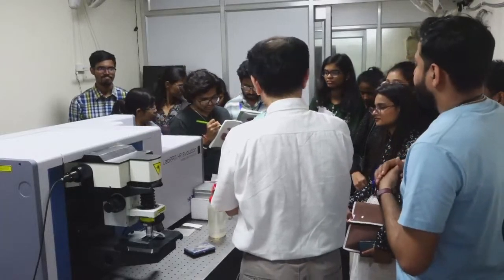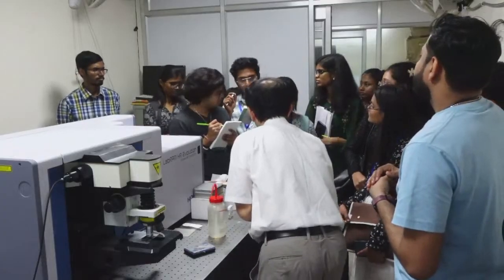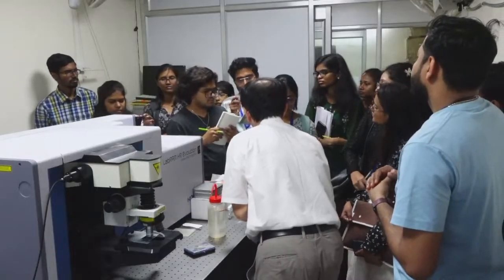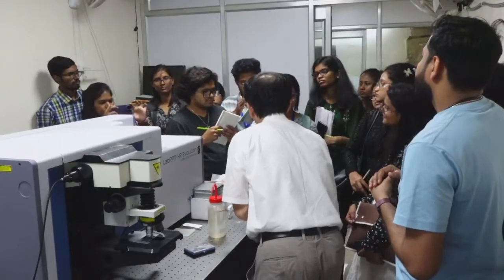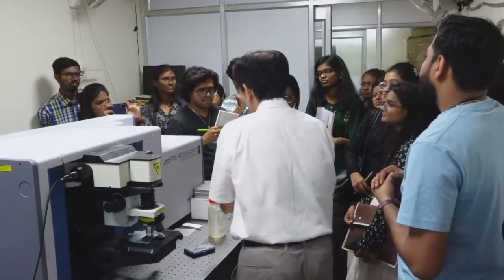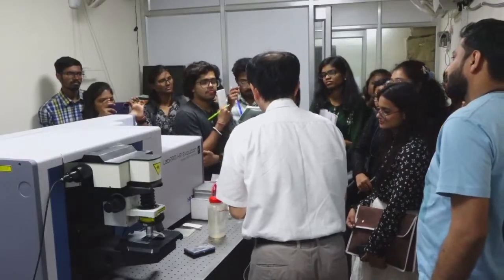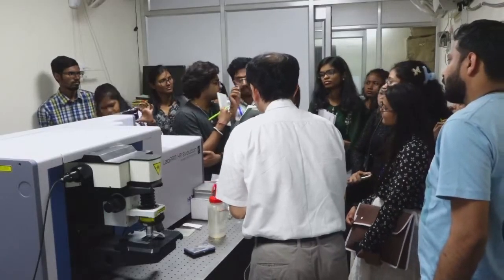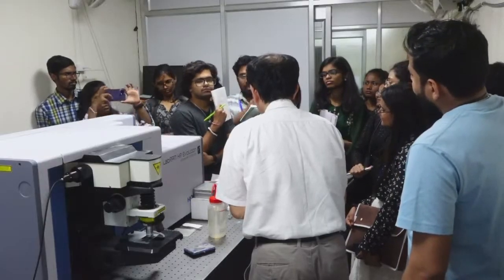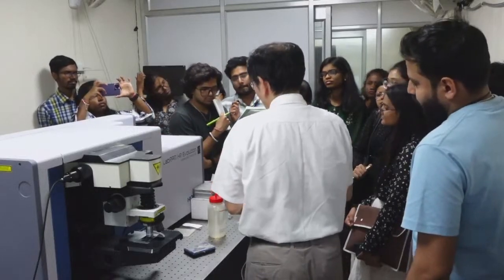Any other question? Is there any effect of the sample area, between a larger sample area and a small sample area, on getting a strong Raman signal?